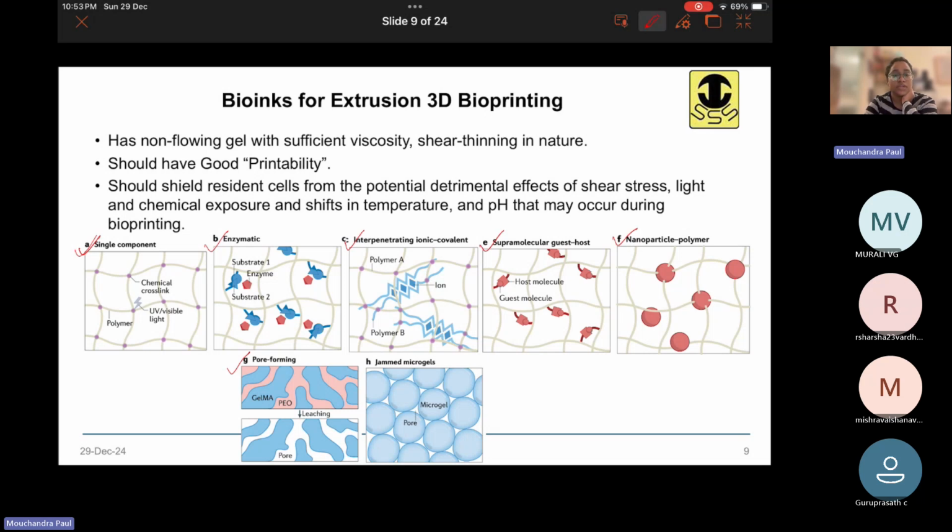So when you remove the secondary material that you added for increasing the shear thinning property, that will be dissolved out and create pores inside your 3D structure. And that's good. Those pores are good for nutrient and oxygen diffusion within the structure, and cells will grow better, right? Or you can just make a bioink composed of gels only.